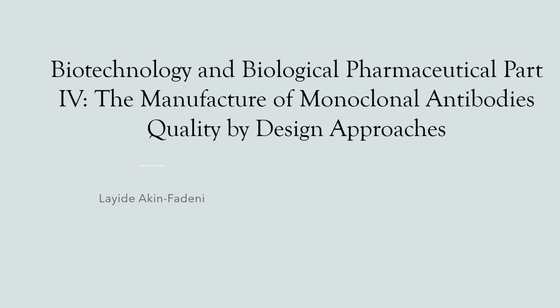Today, I am going to do a presentation on the manufacture of monoclonal antibodies using quality by design approaches. In this presentation, we're going to be looking at the design aspects of the monoclonal antibody and of the cell substrate itself in order to improve yields and to have a more efficacious clinical performance.